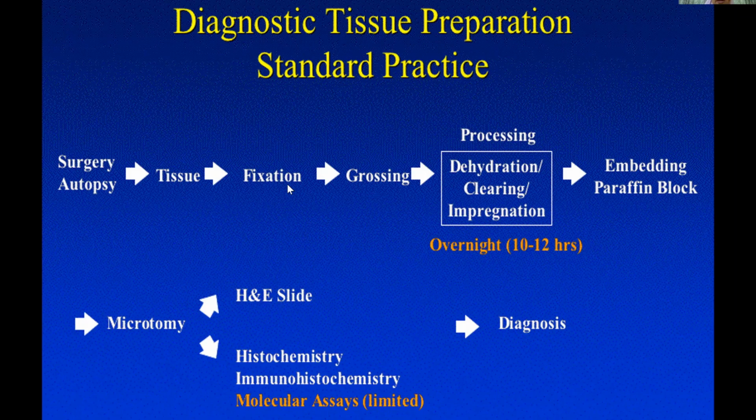Fixation is a very important step, and I will tell you further about its importance. This is the first step. Fixation depends on the size of the specimen.